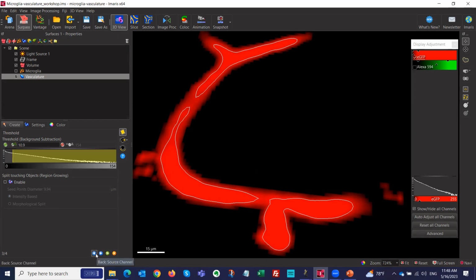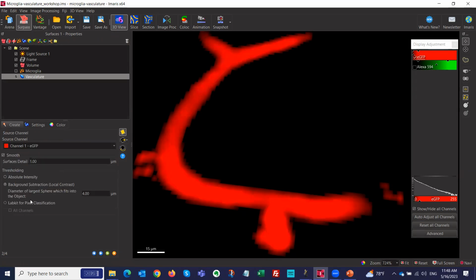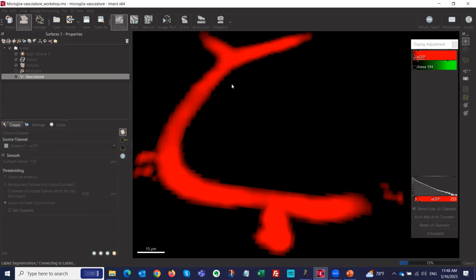Previously, we had to use the slider, which is okay, but with the Labkit for pixel classification, if I start this up, it connects the bridge. Let's hope it works, because remember Stoyan, it didn't work earlier because of the HDMI connection.